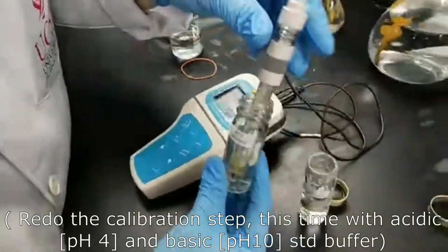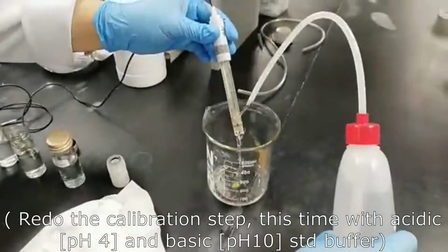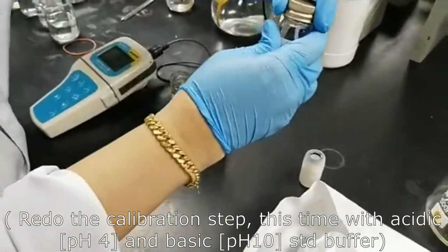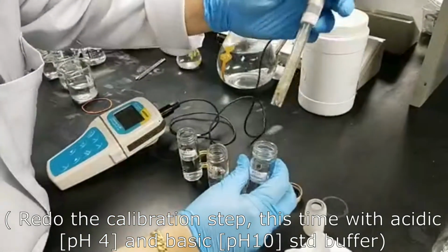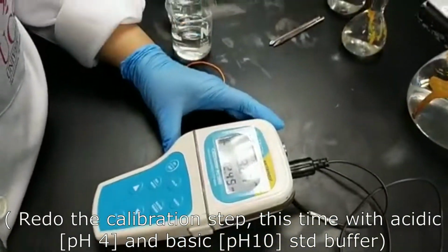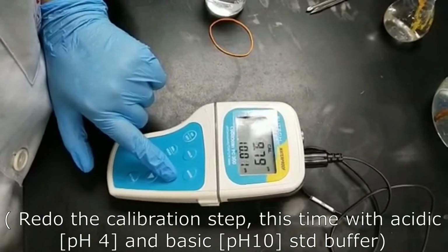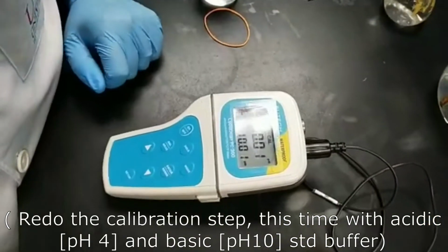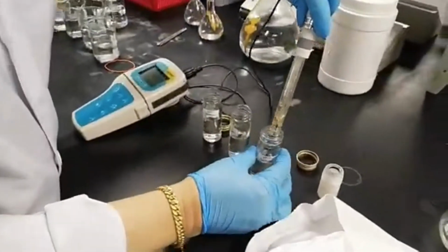Now next is pH 10 calibrator. Okay, press enter. Okay, now the pH meter is ready for use.